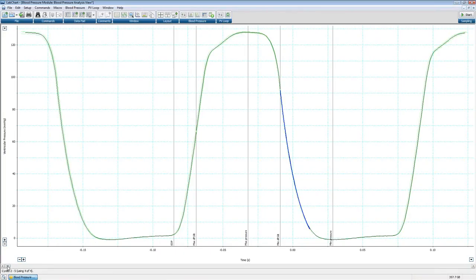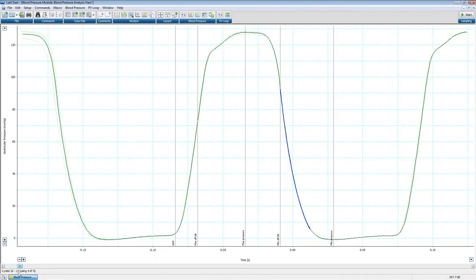If I go down here and move forward, you can see here in the lower left-hand corner, I'm going to go ahead and spotlight it. You can see, we're looking at the average of cycles 10 through 13 right now. We're using 4 of 4. Once again, down here in the lower left-hand corner, we also, of course, have the scroll bar here. We have all the usual range or y-axis and x-axis adjustments that are available on the chart view.